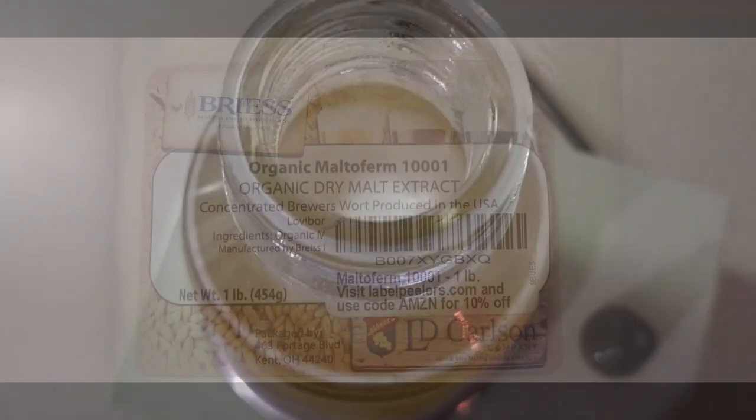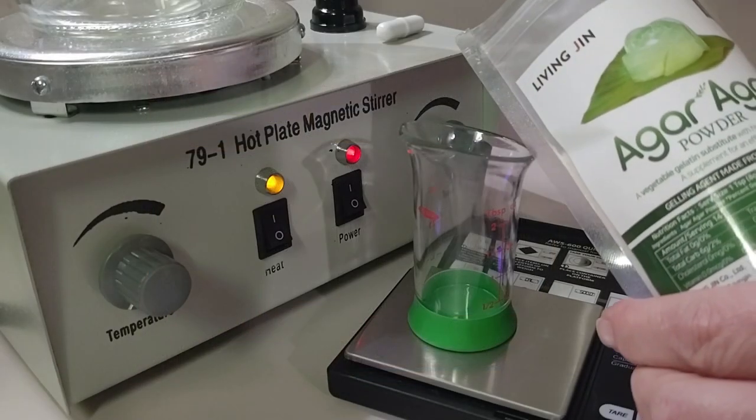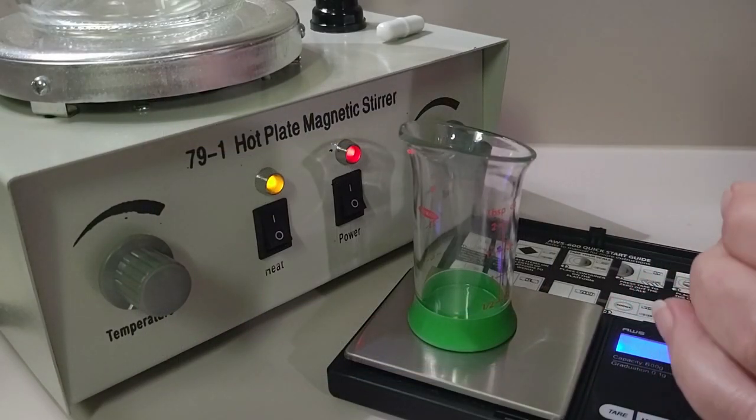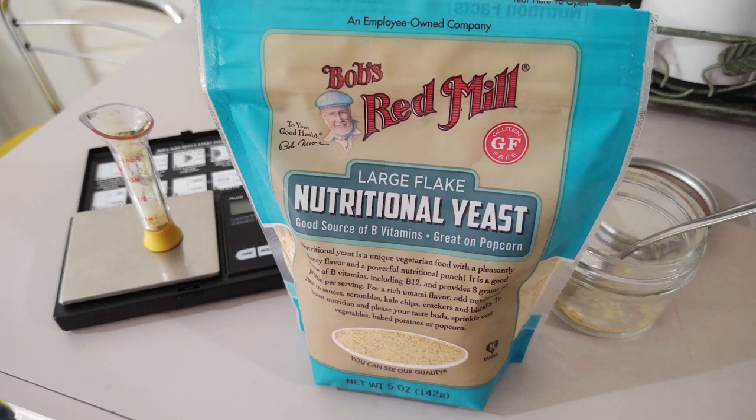In one of our previous videos, we discussed how to make an MEA, or malt extract agar. We found that the results were amazing after we made our transfers, but we weren't getting that amazing rhizomorphic growth we wanted. Through much research and many transfers, we found the perfect recipe to get that beautiful rhizomorphic growth we wanted.